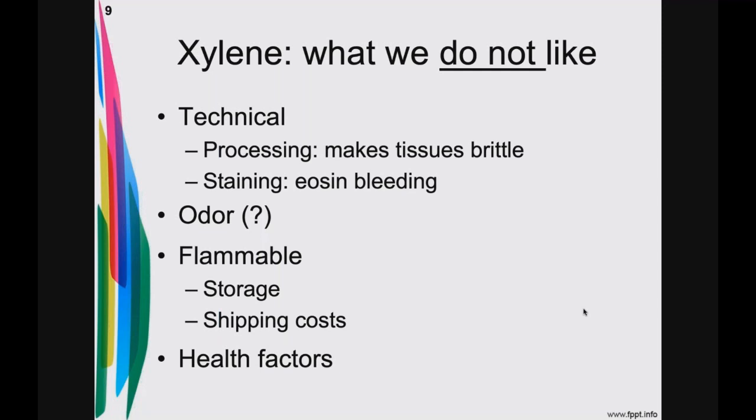Also, on a technical level, xylene is categorized as a flammable liquid. That means you must store it in a flammable cabinet. You've got those rules by the fire marshal in terms of how much you can have and where it can be stored. As it's being shipped to you, it is considered also by the Department of Transportation to be flammable, and you are paying added costs for shipping. Not only to have it shipped, but the manufacturer must package it in approved shipping boxes and such.